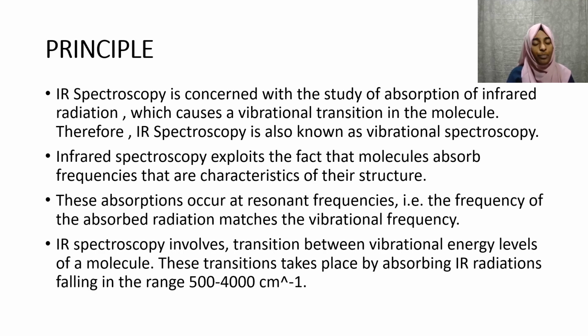Coming to the principle, IR spectroscopy is concerned with the study of absorption of infrared radiation, which causes a vibrational transition in a molecule. As it causes the vibrational transition in a molecule, it is also known as vibrational spectroscopy. Infrared spectroscopy exploits the fact that molecules absorb frequencies that are characteristic of their structure.